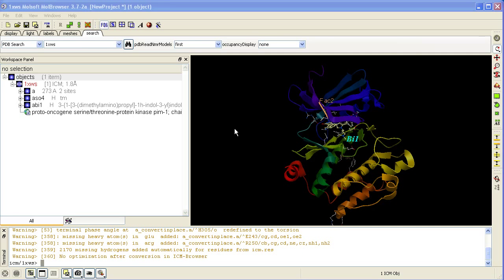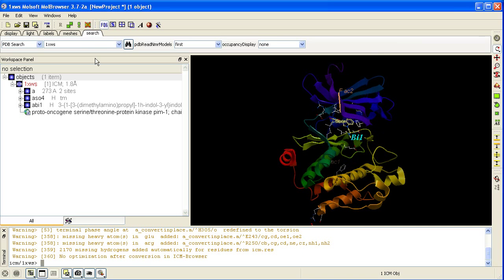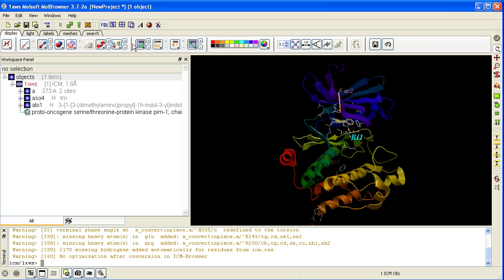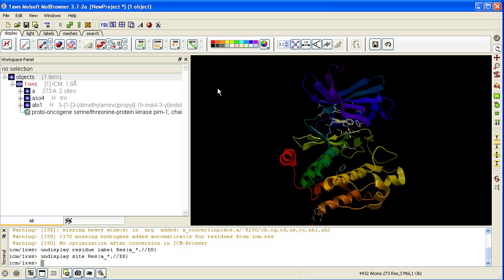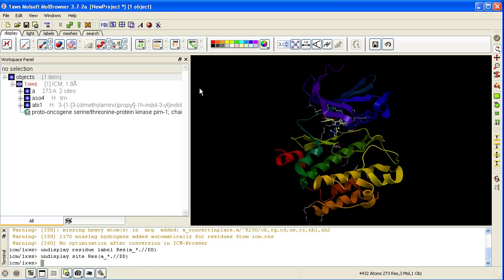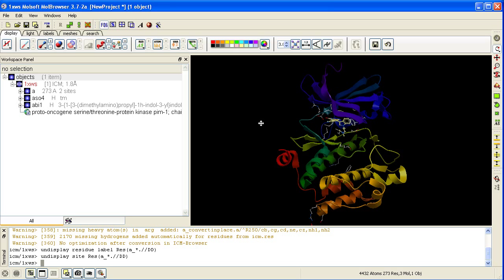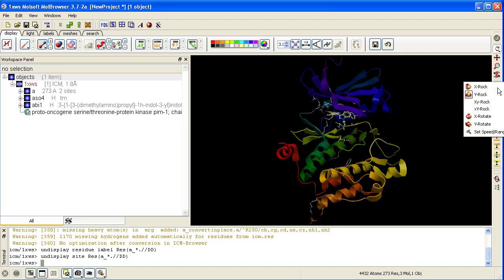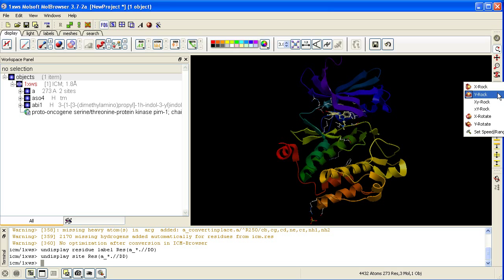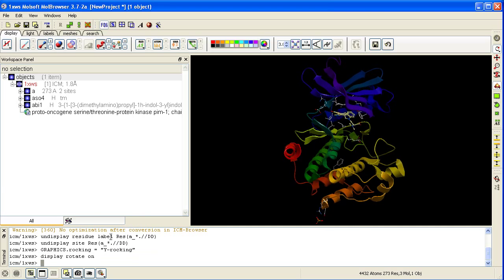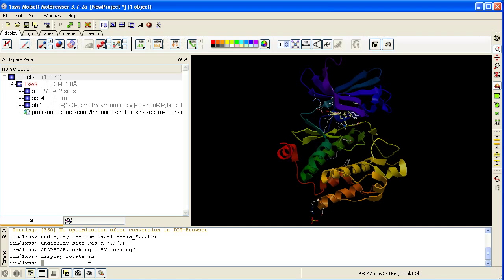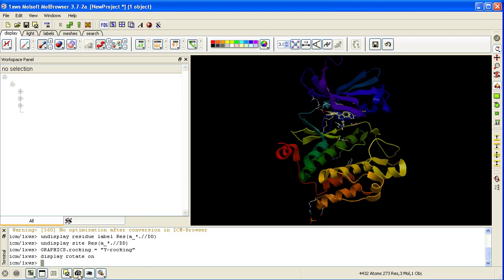In the first slide we will undisplay the annotation, the residue labeling and the sites. Our main aim is to focus on the unusual hinge region between the N and C terminal which is seen in PIM kinases. Our first slide will be Rocking. Click on here and choose Y axis Rock. Then make our first slide by clicking on the Camera button here.